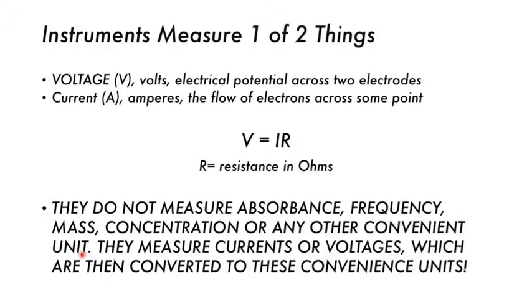I would encourage you to look that up though if you're particularly interested. I won't be asking you the inner workings of it. Just the thing that I want you to take away from this is that we're using electricity and not some physical thing when we're measuring. And what I might have said there might have been totally wrong. Like I said, I'm not quite sure how the mass is measured. That's not my field of specialty, unfortunately. Sorry about that. No problem, sir.